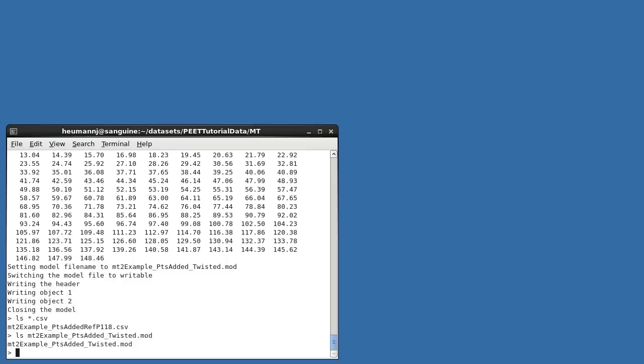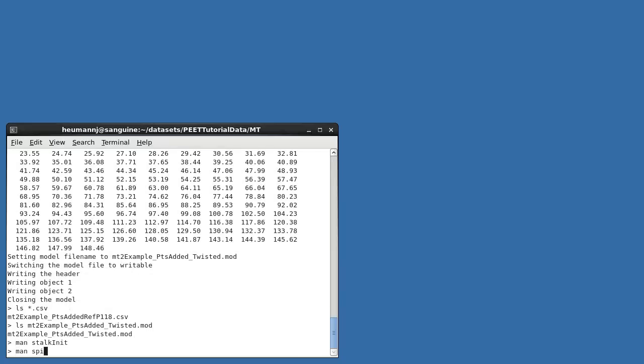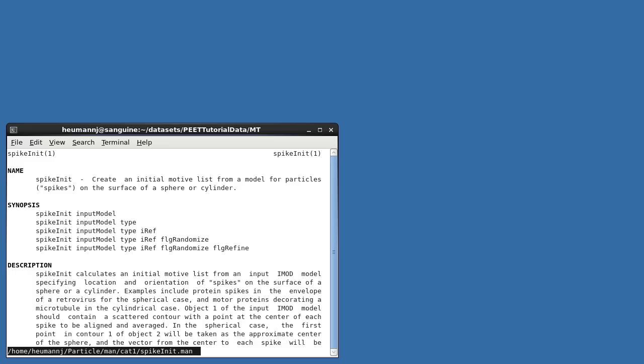So we could now proceed with an alignment using this initial motive list and model as the starting point. modTwist2EM is typical of a PEET program which generates an initial motive list for a specific case. Let me briefly mention two others which also ship with PEET. stalkInit works with isolated particles which nevertheless have a preferred axis, for example bacteriophage or fatty acid synthase. spikeInit is intended for use with spikes protruding from a spherical or cylindrical surface, for example retrovirus spikes or tobacco mosaic virus coat protein.